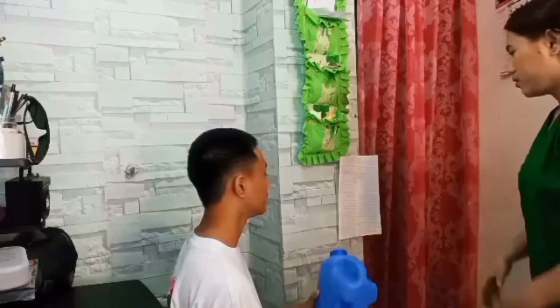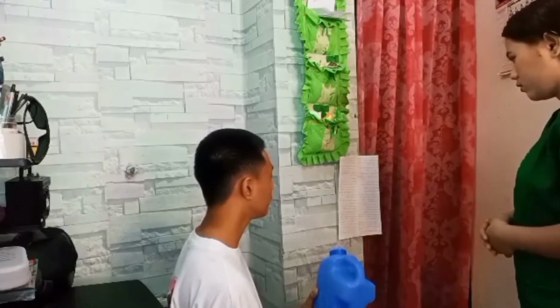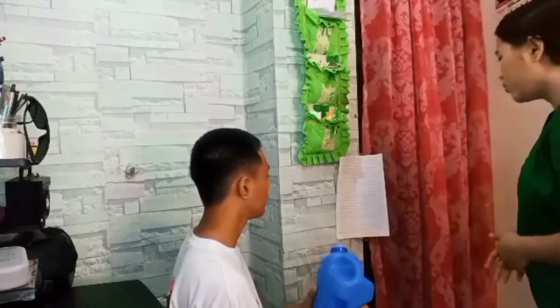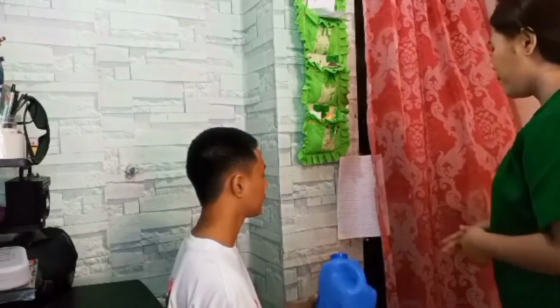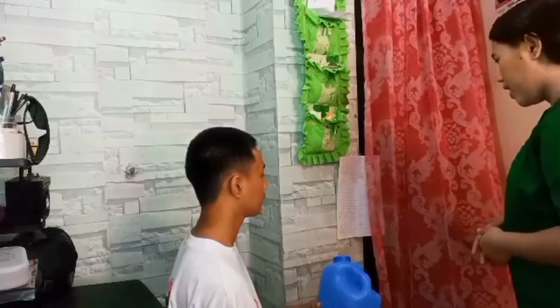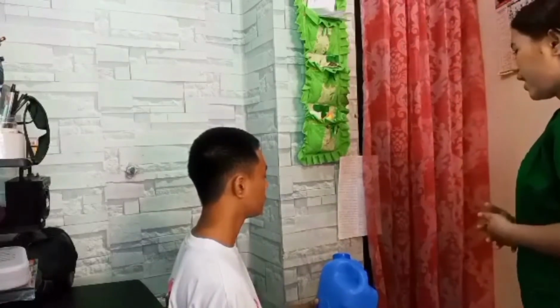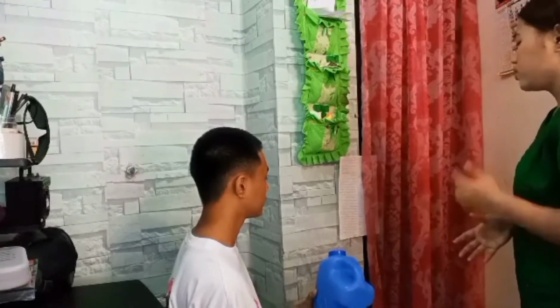I have a question, miss. Yes, sure, what is it? I forgot to pee in the container. Well, that's a really good question, sir. If you forgot to urinate into the container, we will have to totally start the test again, which means we have to discard all the previous urine and start from the beginning.